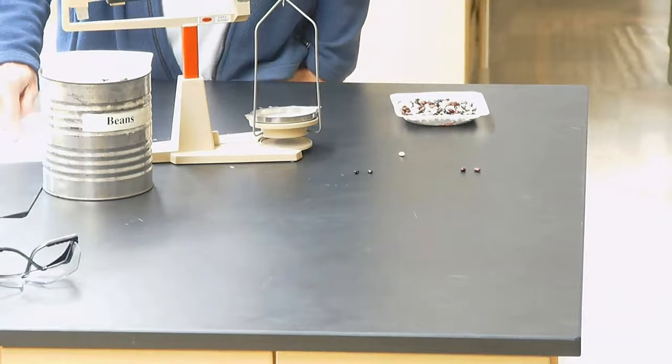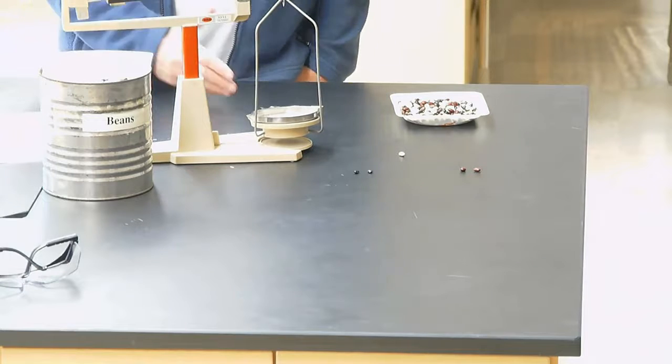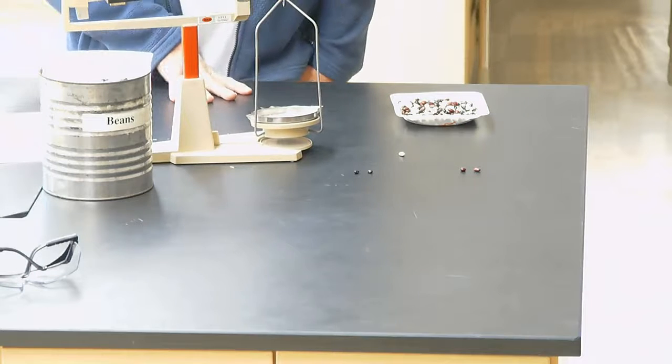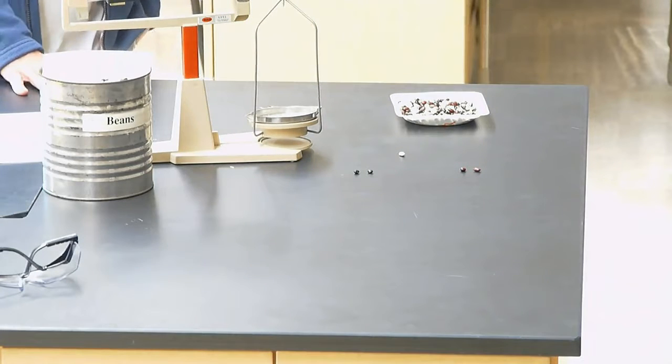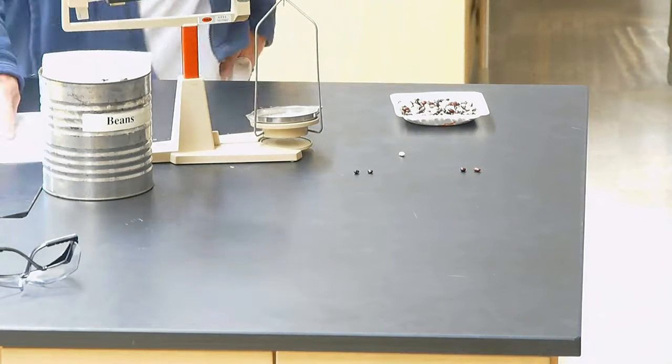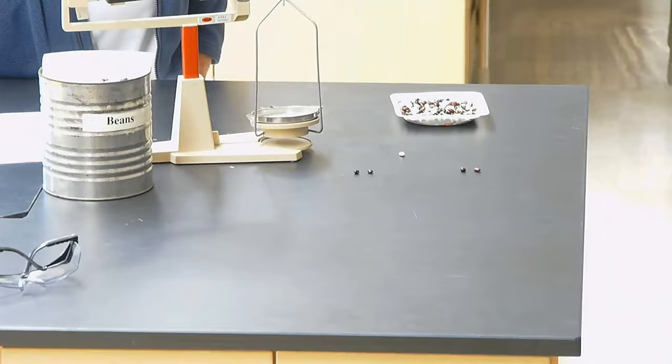Then it says mass of beans. So at that point, you would take all of your whites and find the mass of them. Then all your reds separately and all of your blacks separately and find the mass of each one. And then you would find the total. The third column over says the mass of single bean atom.